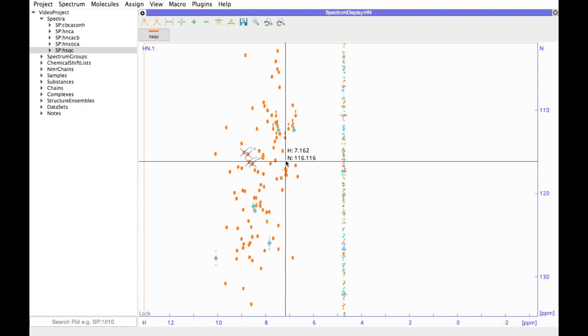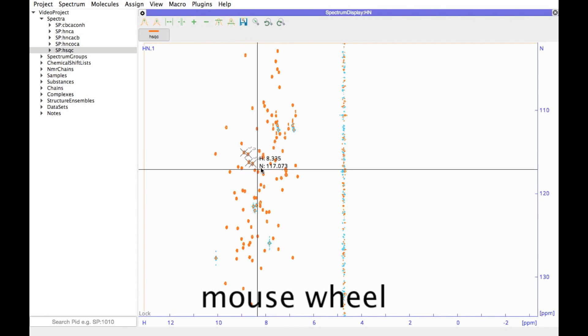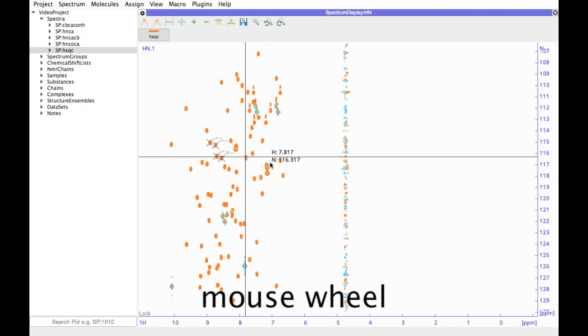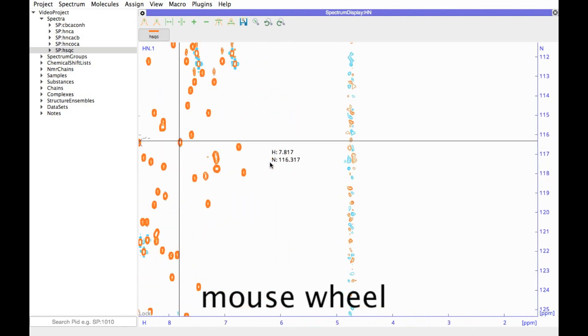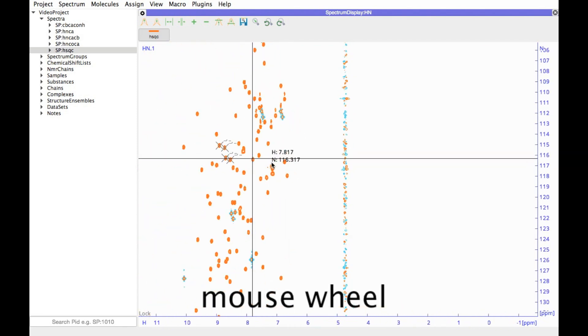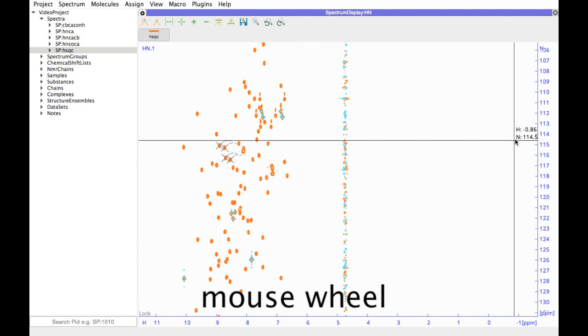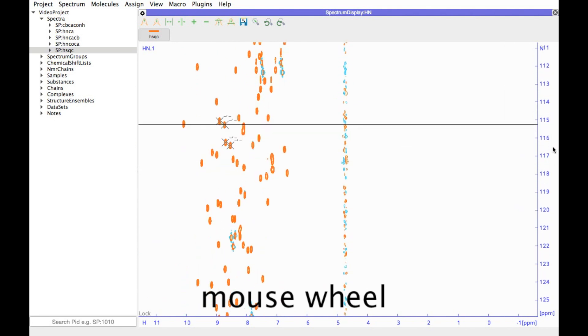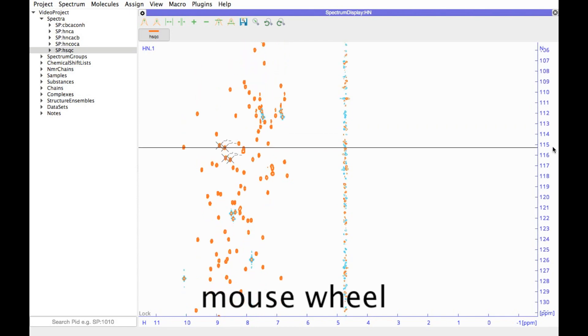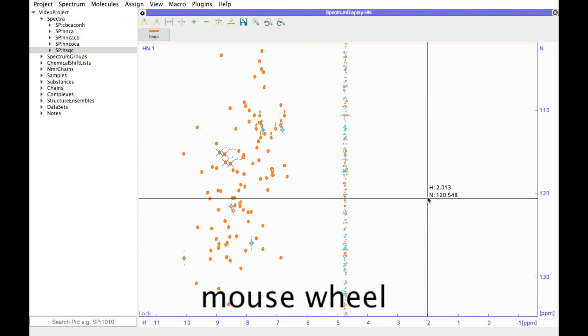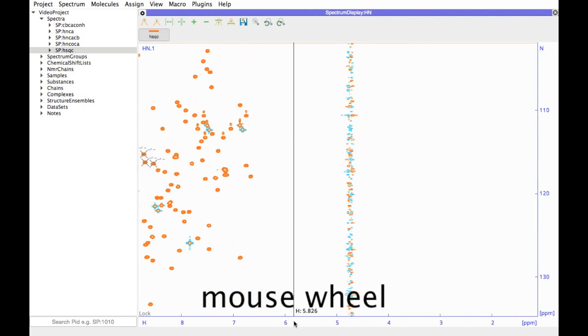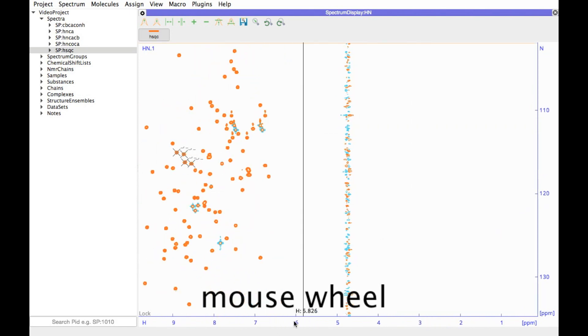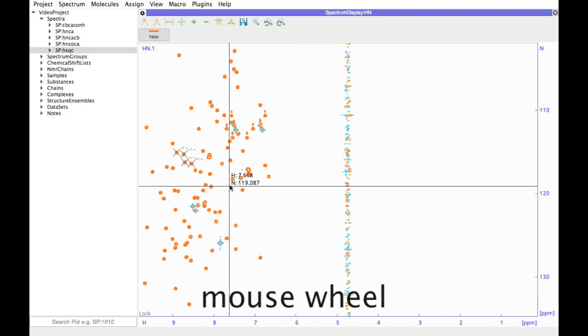You can zoom using the mouse wheel to zoom in or out. If you do this while you have the mouse on one of the axes, then you zoom selectively on that axis, which in effect changes your aspect ratio.